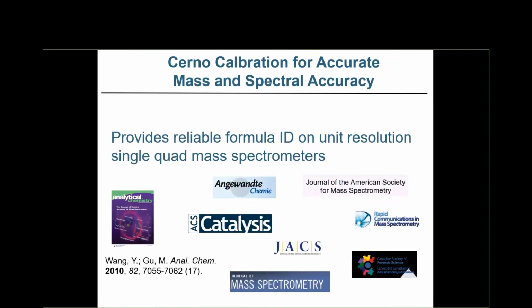And in fact, if you're an organic chemist and you want to publish a new structure, one of the things you need is to have a confirmation of the formula. Generally, they look for accurate mass measurements. Our effective mass accuracy using the combined metrics of accurate mass and spectral accuracy are actually accepted for publication by all of the major organic chemistry journals. So again, to emphasize, it's not magic, it's not new, it's well established and well used technology.